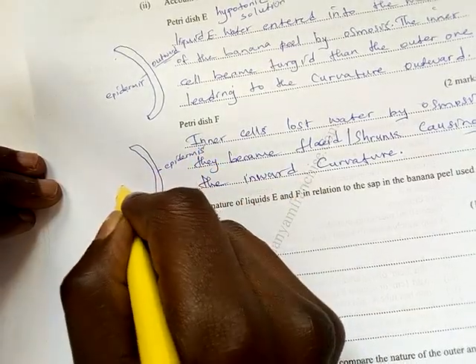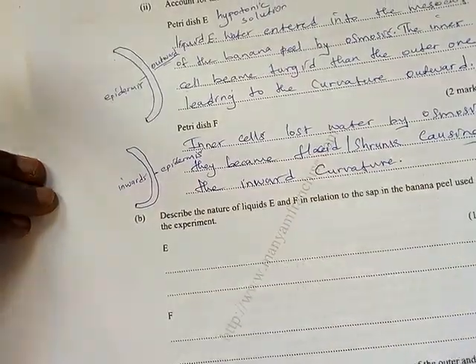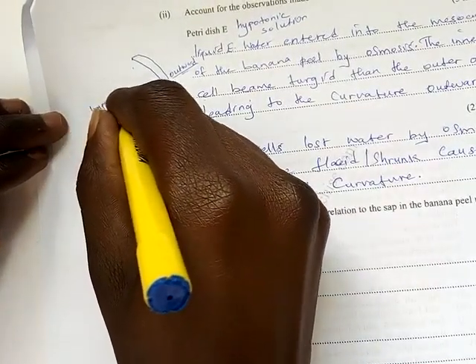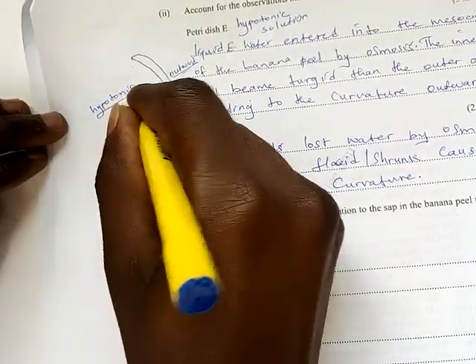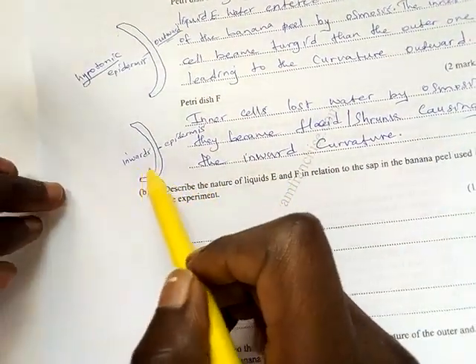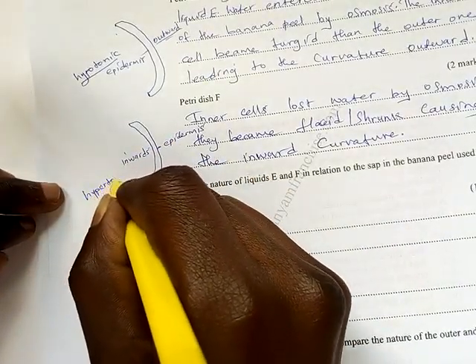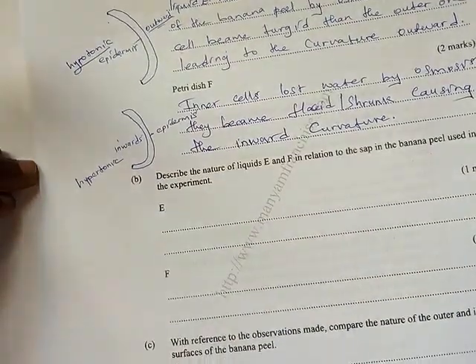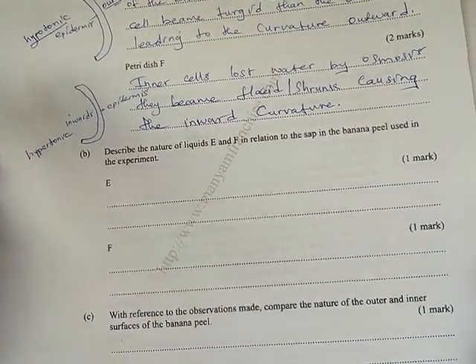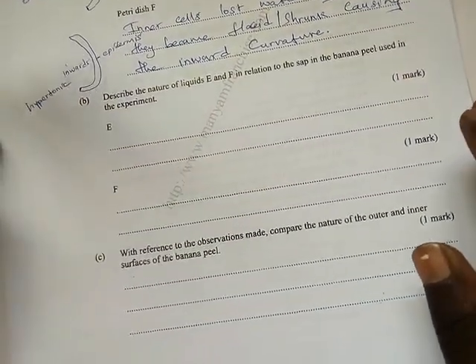It has curved inwards. You see now the difference. In hypotonic, the curvature goes outwards, while in hypertonic, the curvature curves inwards. You should have the content in osmosis in cell physiology.